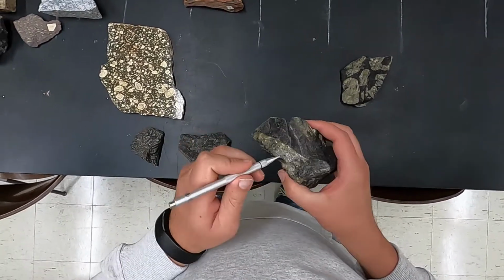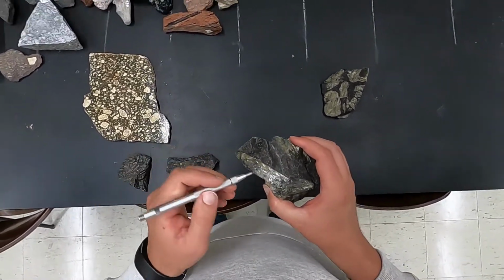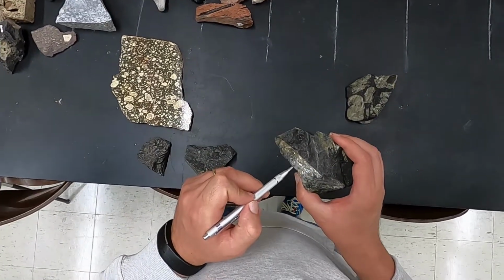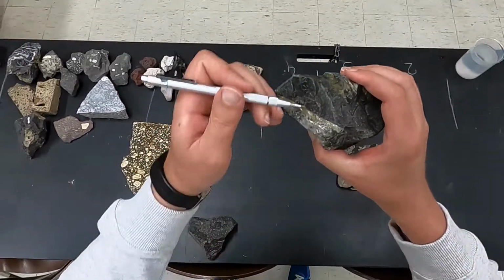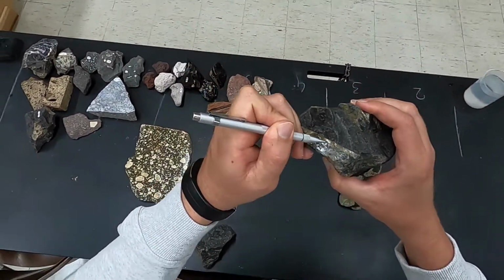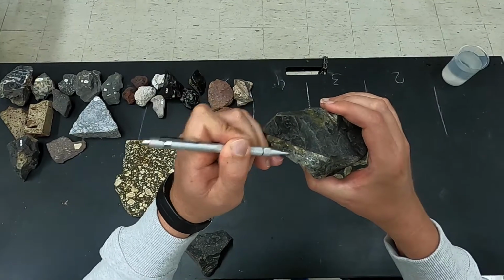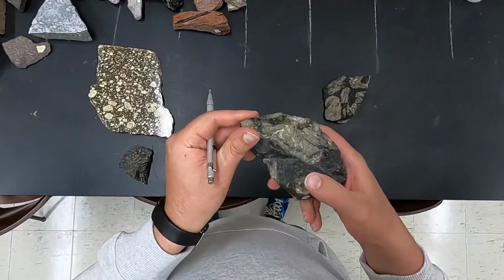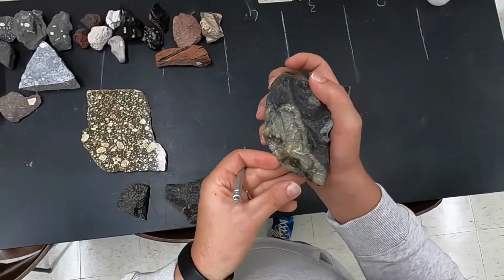characteristic. Usually when you have cooling, you change the composition progressively while you crystallize the feldspar, and so you have a slight change in color here, which although could also be due to alteration. So you have to look carefully at all the crystals.